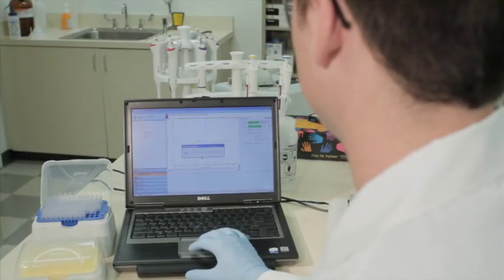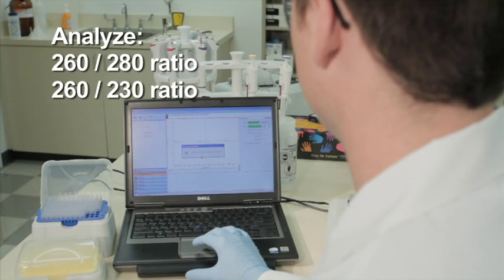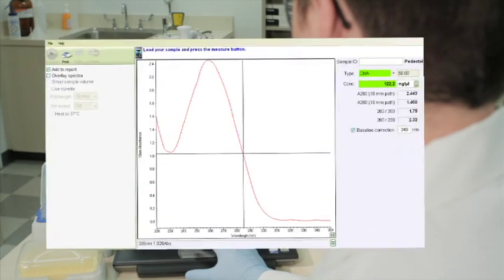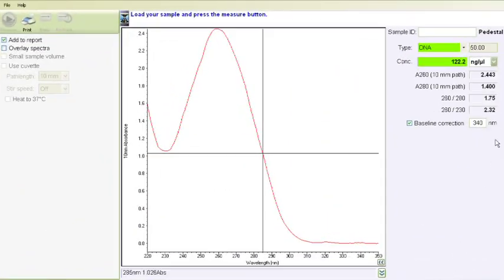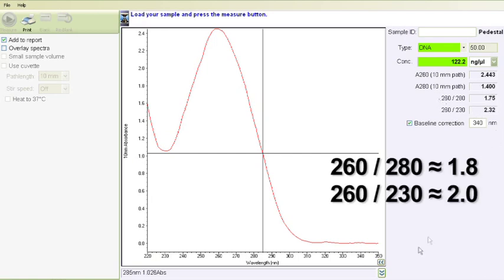To accurately assess sample purity, 260-280 and 260-230 ratios should be analyzed in combination with overall spectral quality. Pure nucleic acids typically yield a 260-280 ratio of approximately 1.8 and approximately 2.0 for DNA and RNA respectively. This ratio is dependent on pH and ionic strength of the buffer used to make the blank and sample measurements.